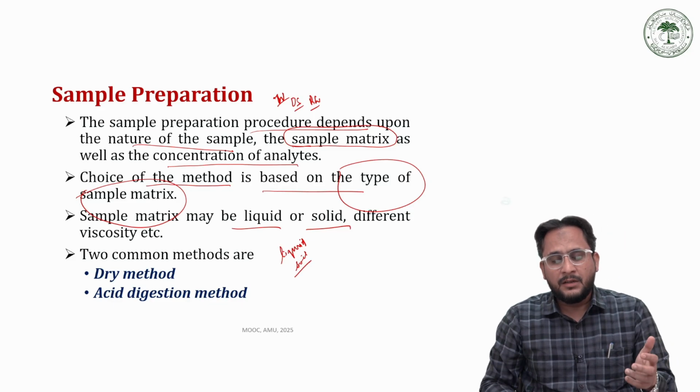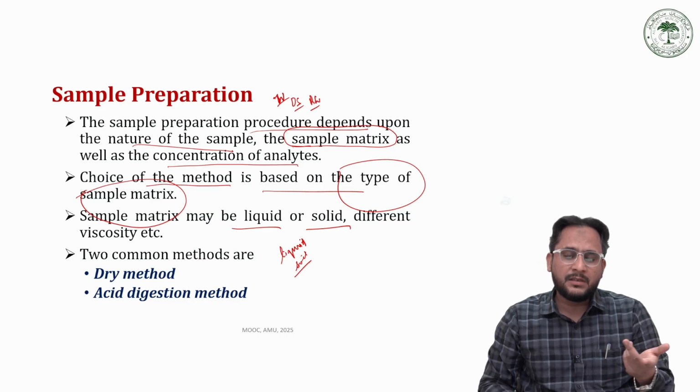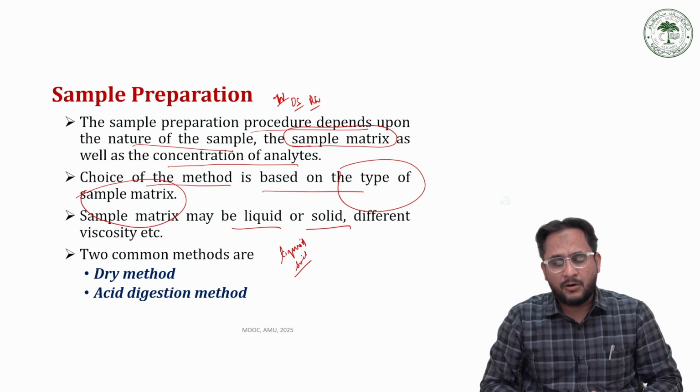For example, we have a piece of land which is very close to an industry, and there is a history of soil pollution in that particular area by the nearby industry, and we have been given a task to identify the type of heavy metals present in the soil, so that we can identify whether that soil is good for agriculture or some other kind of activities or not.